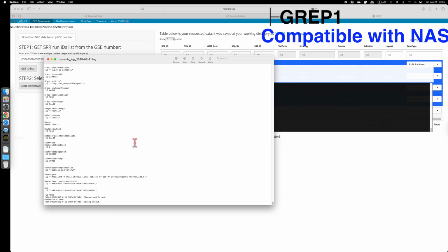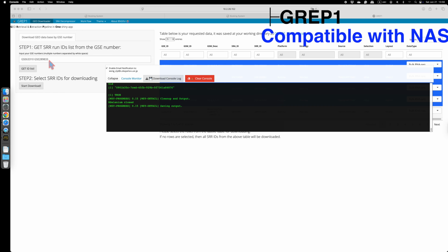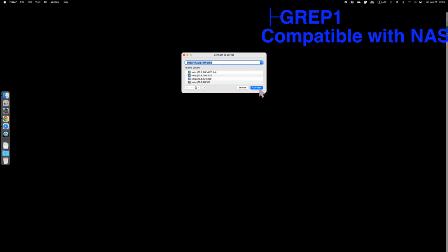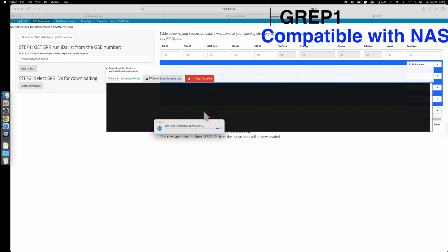As members of BSGOU and Okayama University, you also have access to our online NAS, where you can check, upload, or download your processed data. Here, for example, we are uploading our downloaded log file directly to our working directory on the online NAS.